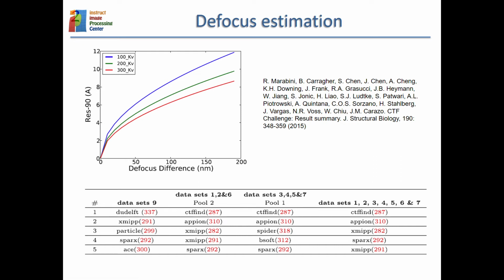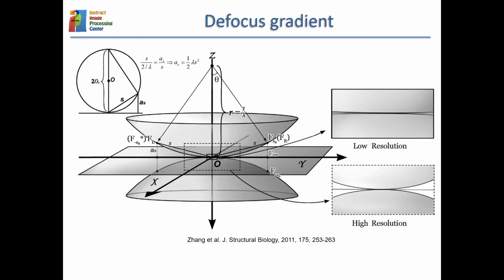And not only that, you should average the results from those programs, because it doesn't matter how accurate they are, they will commit errors, and these errors will tend to be, hopefully, randomly distributed. So if you average several estimations, you are reducing the estimation error.